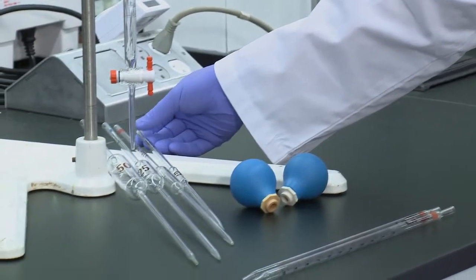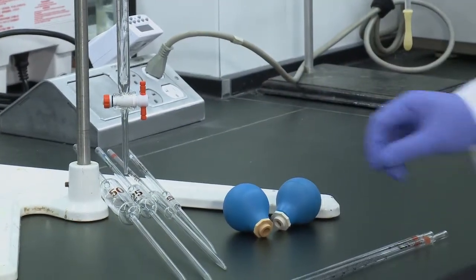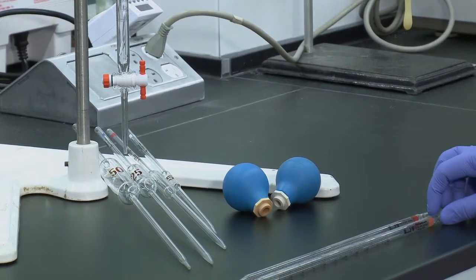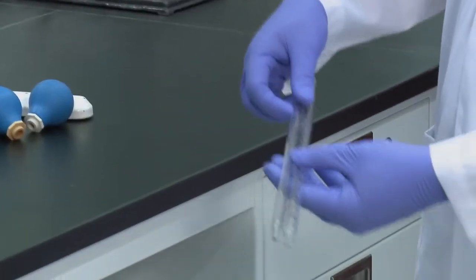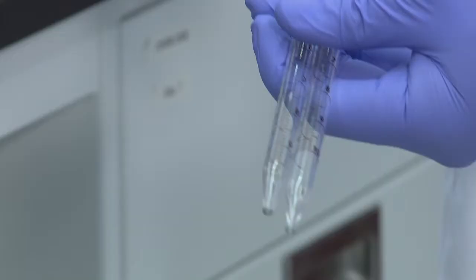If you require a volume that is not associated with one of those pipettes, you have two other graduated pipettes. There is a slight difference and you can tell by looking at the tip here.